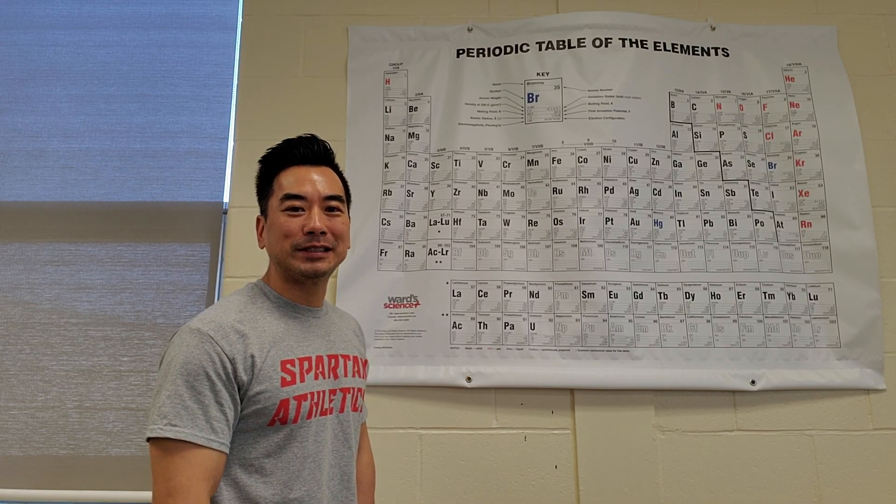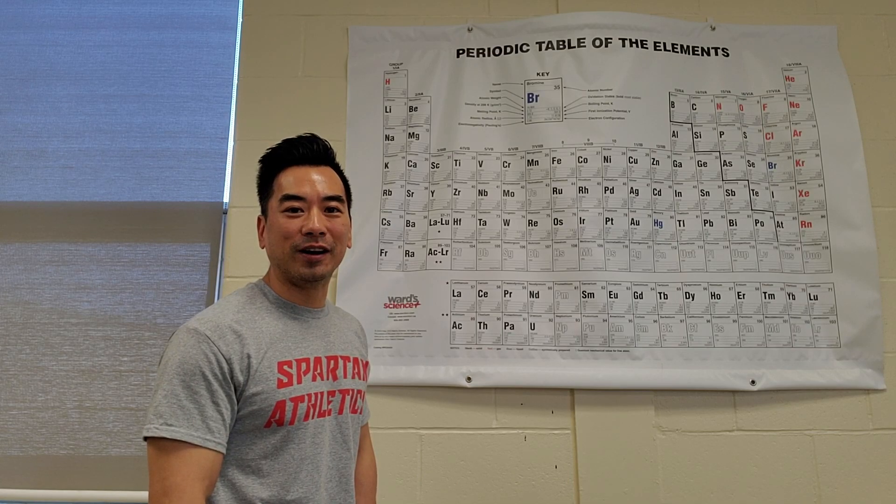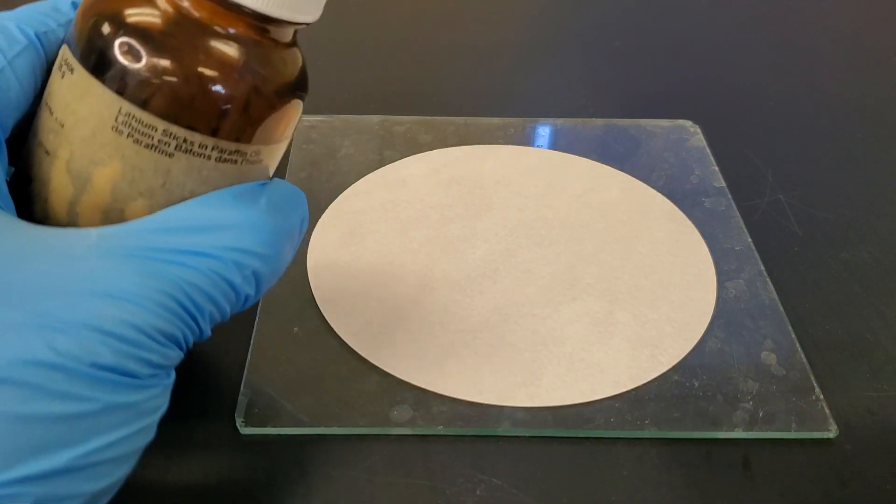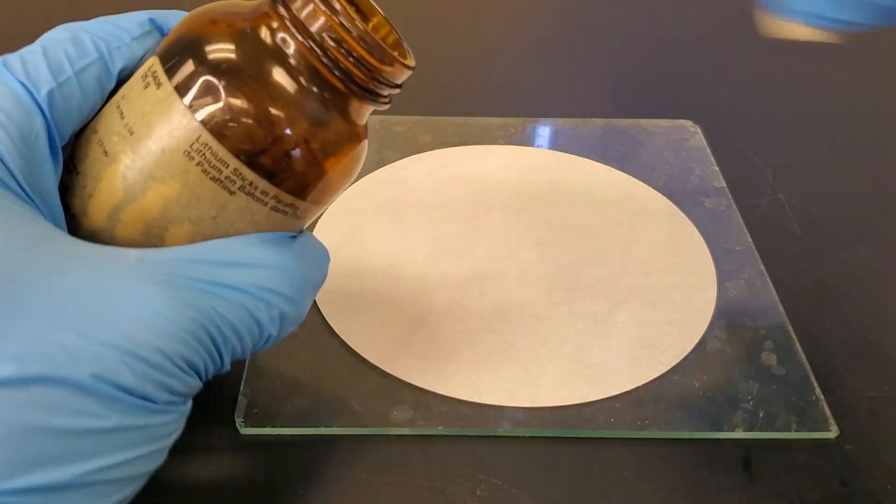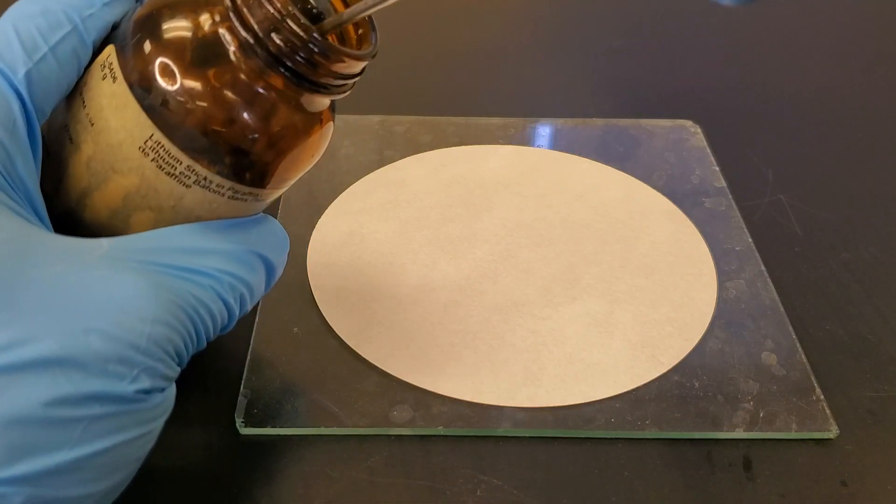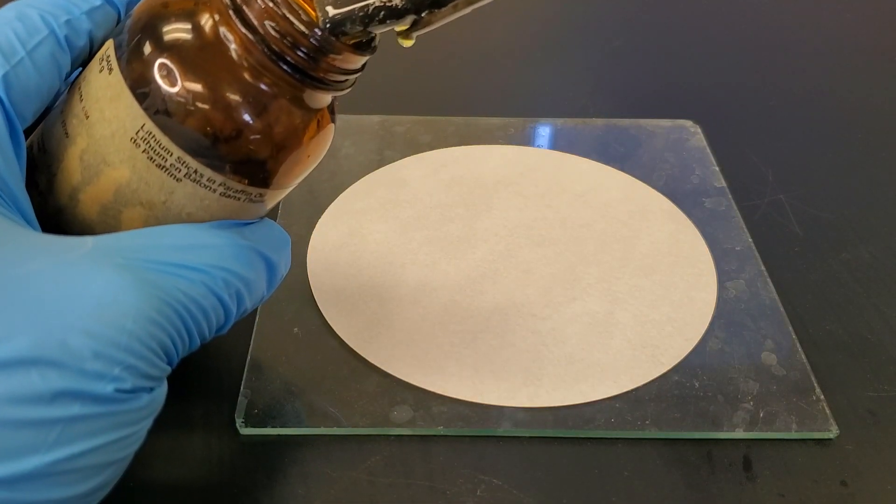So let me show you how lithium, sodium, and potassium react with water. The alkali metals react with water so I need to wear gloves since our hands have natural moisture. Alkali metals need to be stored in oil so they don't react with the oxygen in the air.